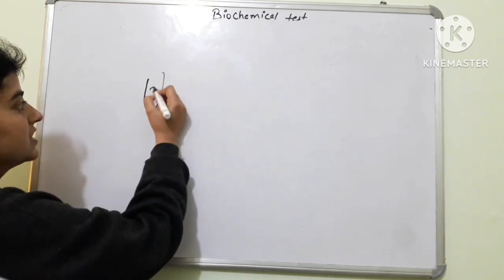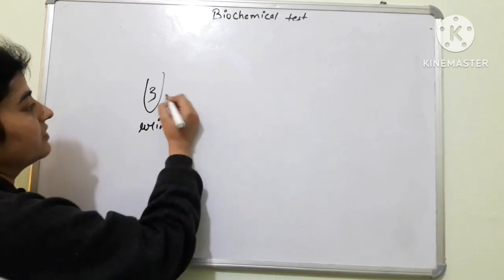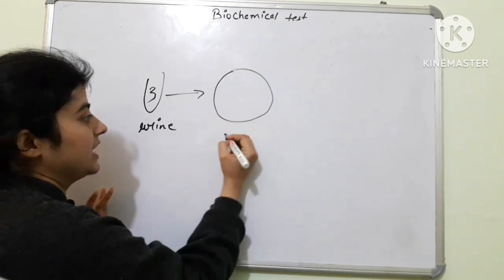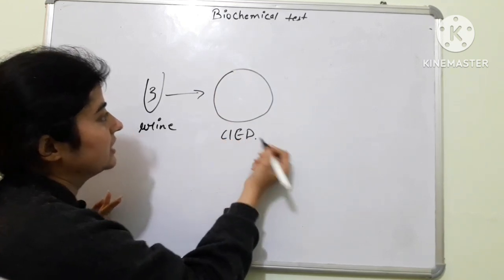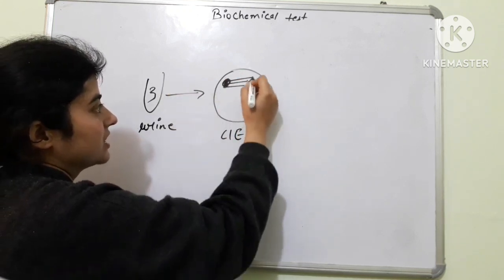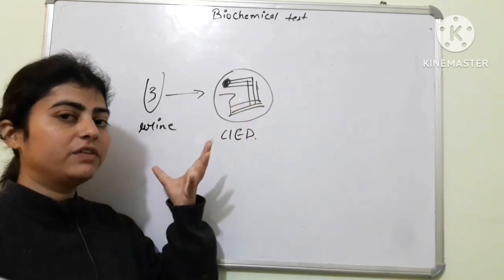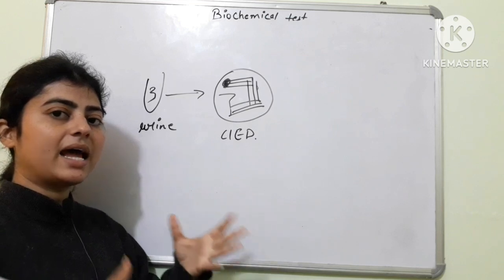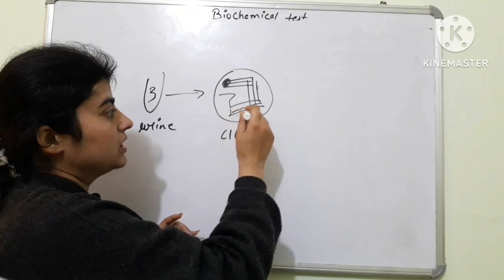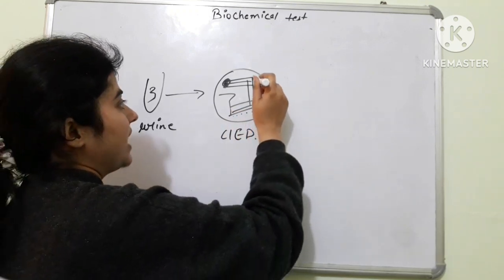First we receive a specimen, for example a urine sample. Then we take a proper culture media for urine, that is CLED. Now we make a well with the help of the sample and then streak it. Incubate it for 24 hours at 37 degrees Celsius, and then after 24 hours we will find small growth of bacteria, which is called a colony, on this entire Petri plate.